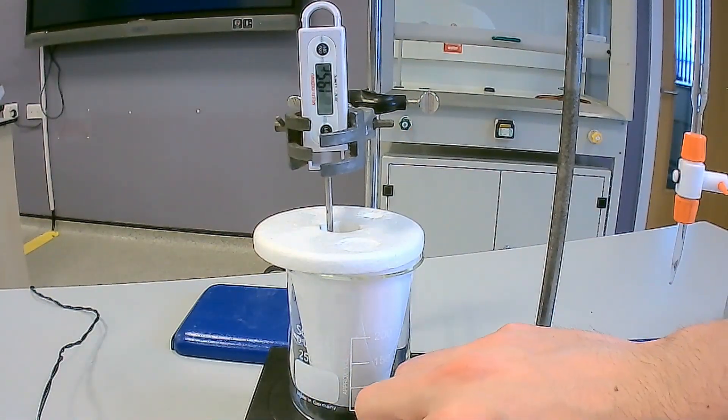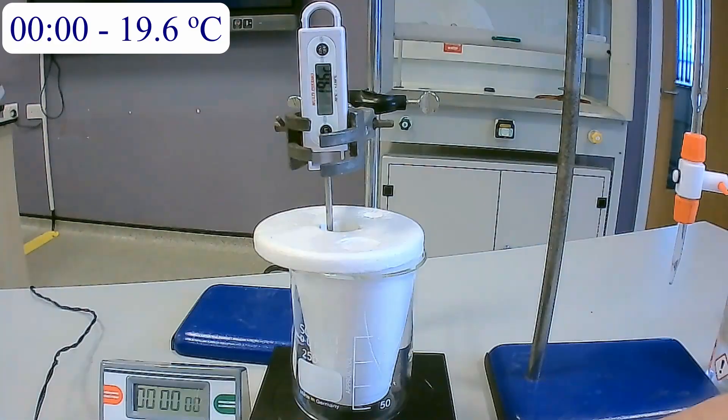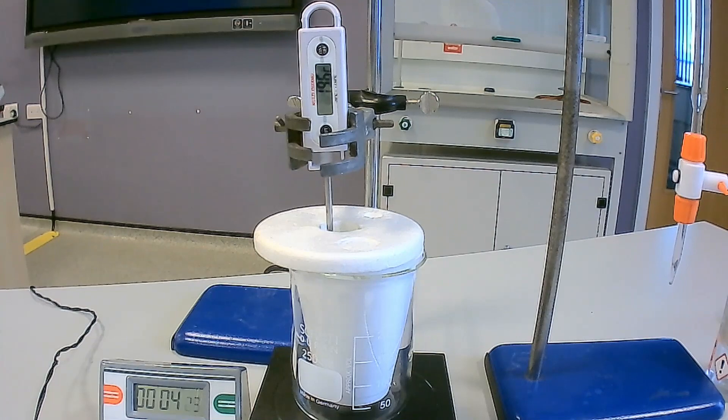Turn on the magnetic stirrer and begin a stop clock. Record the temperature at zero seconds and then every minute for the first three minutes. Place these results into a suitable table.